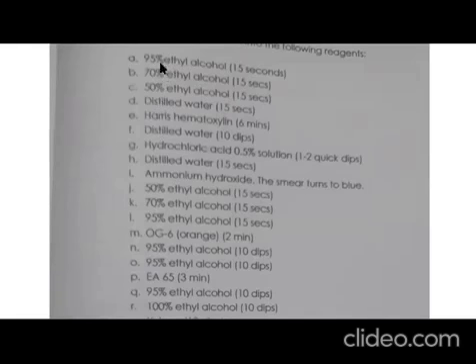Sir, why do we need to hydrate the cells? Why do we need to hydrate the smear? This is to prepare for hematoxylin immersion later on. Also, if you can see, there are still varying, decreasing grades of alcohol, because again, we're still trying to minimize cell distortion as well as cell loss from the glass slide.